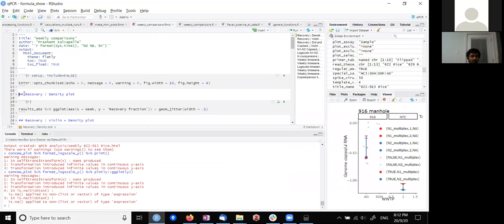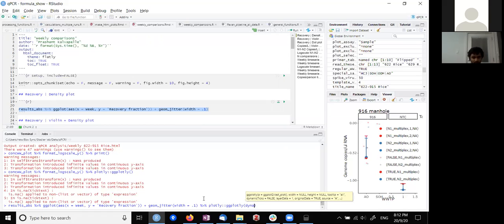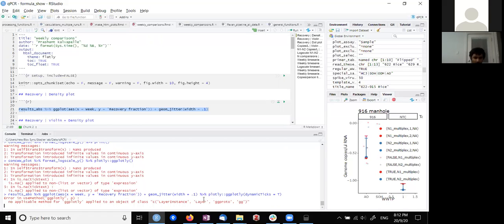For example, for this one, it turns out that these things that have the plus command on it, you can't change them.